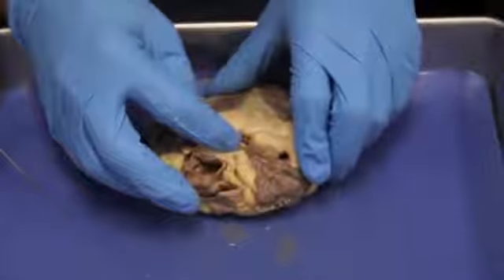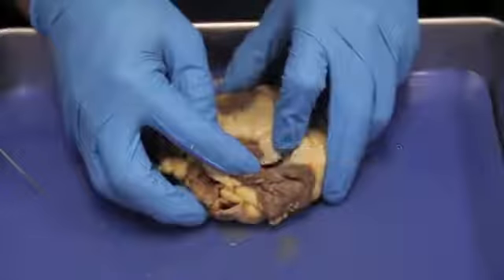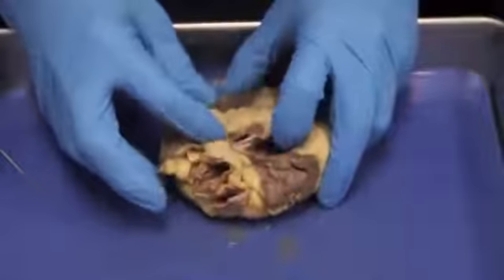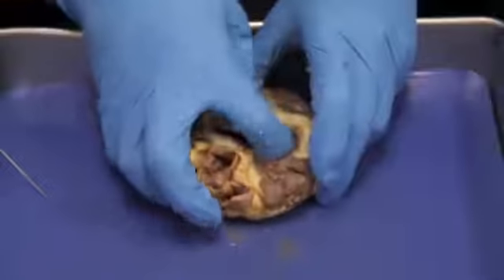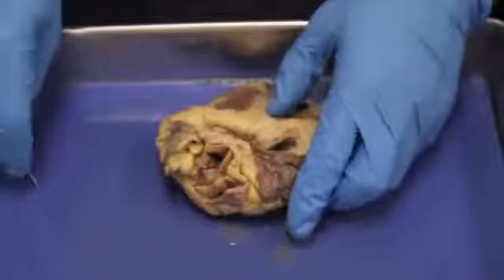Now, we're going to take a look at the pulmonary veins, which dump directly into an atrium, which we can see here. And then we have the vena cava, which also pours into an atrium, into the right atrium and the left atrium.